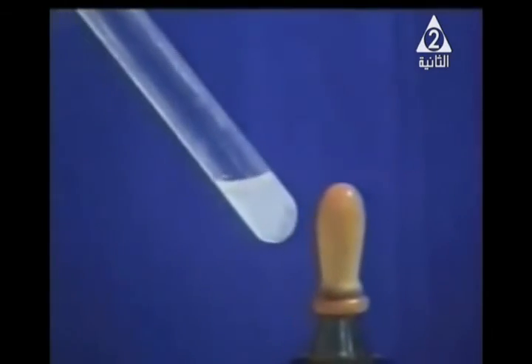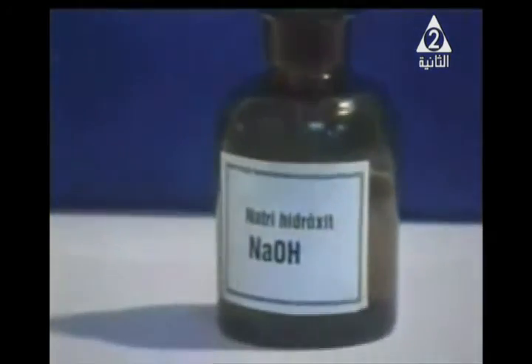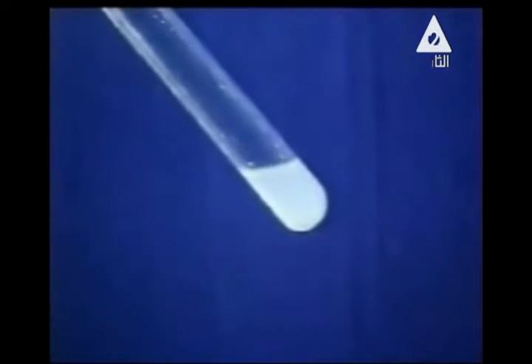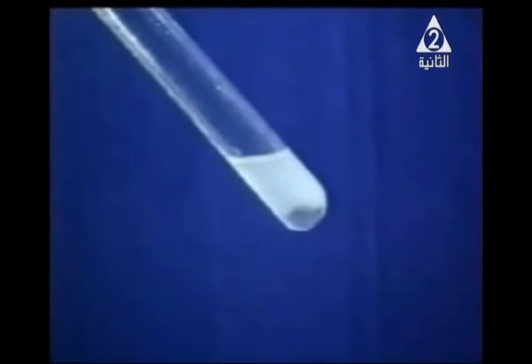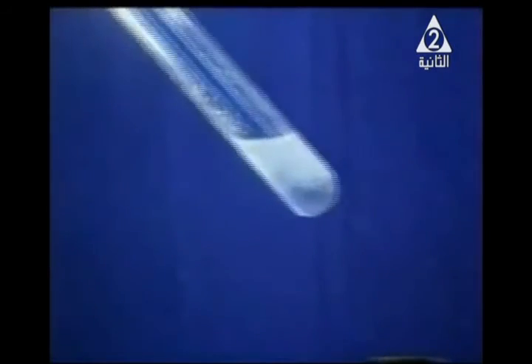If you add more sodium hydroxide over this white precipitate, it will react with the sodium hydroxide, giving sodium aluminate. So on adding sodium hydroxide to aluminum hydroxide, the white precipitate, the reaction continues giving sodium metaaluminate, which is soluble in water, so the solution becomes clear again.